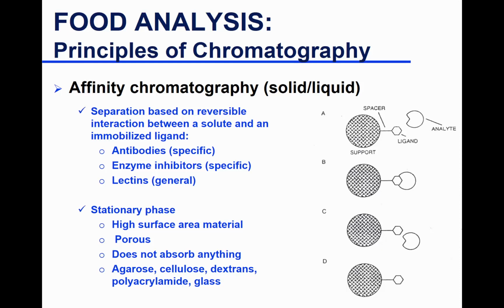Affinity chromatography. And just to remind you guys, there's a lot of information here, but throughout the semester we'll be giving examples of anion exchange, cation exchange, affinity chromatography, and so on. They will come back. Here we're just learning the principle. Later we'll learn application, and then everything will fall into place for you guys.